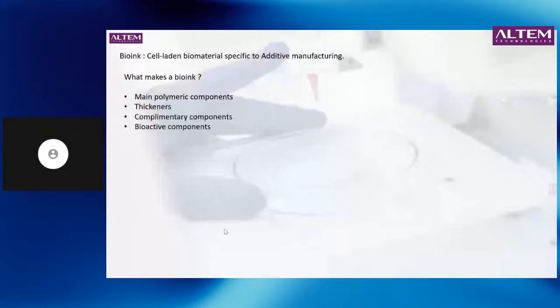To that you have thickeners. Now if there is a problem with the viscosity or the stability of your material, you would require adding an additional material to it which can help in controlling the mechanical properties of the material, especially the viscosity, the printability of the material, and will allow in creating stability.